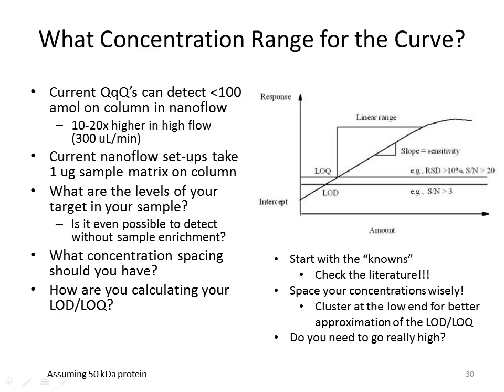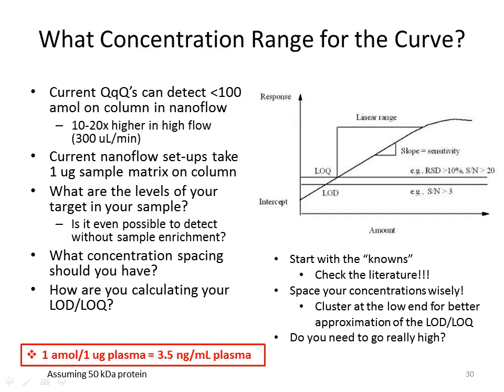And these are just some quick and dirty ways of assessing LOQ and LOD. Again, these are very quick and dirty if you don't even want to go into Excel. A lot of people look at the replicate peak areas, and if their RSD is around, well, I guess 15%, and signal to noise is greater than 20, that's the LOQ. If signal to noise is 3 or greater, then that's your LOD. And your percent RSD should be low as long as you're above your limit of quantitation. And again, these are topics that Cyril and Mani will be going into later.